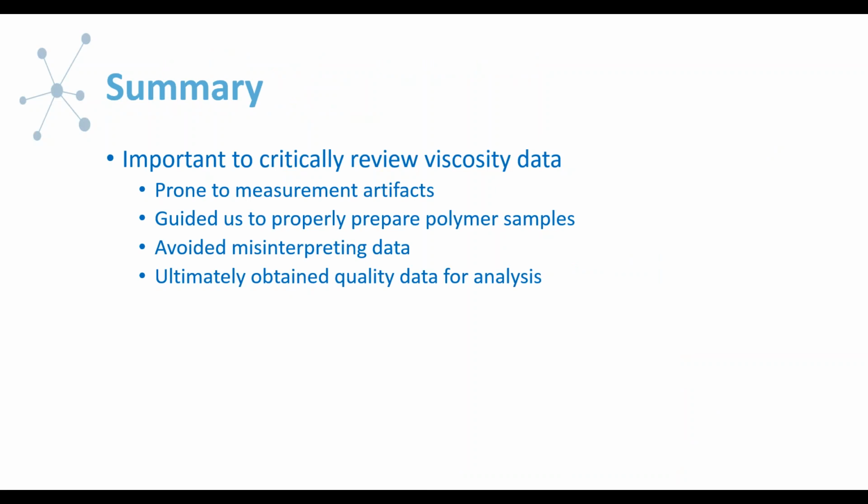That concludes the data presentation. I just wanted to summarize and point out that when you get viscosity data, it's really important not to just accept it, unless you're in a quality control environment where you test the same thing over and over again with no opportunity for unusual behavior; that's an isolated case.